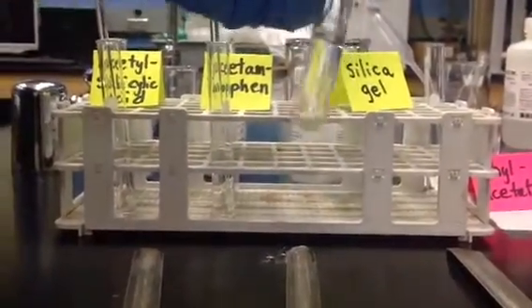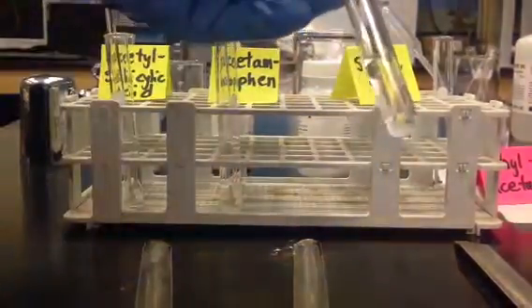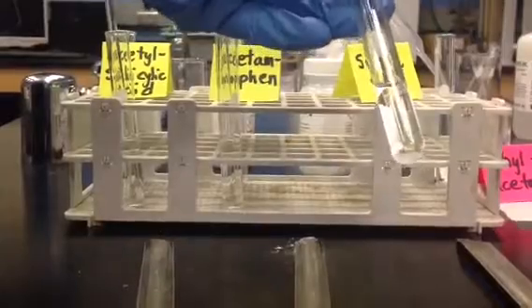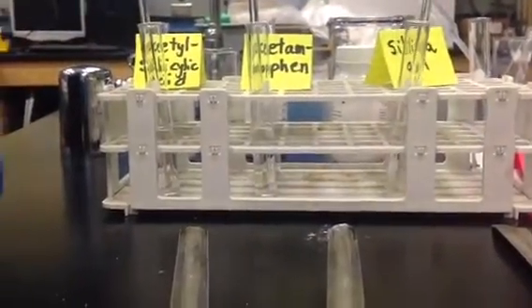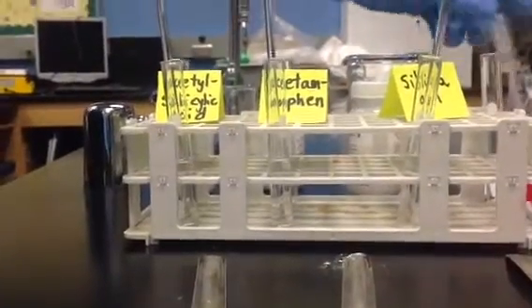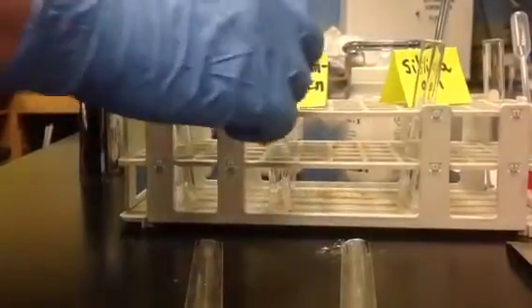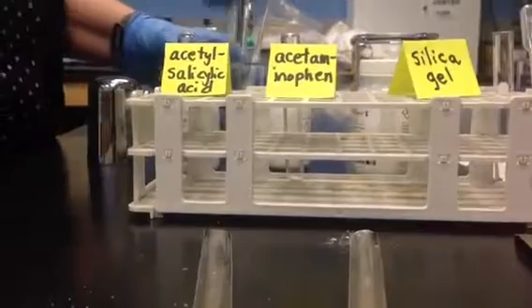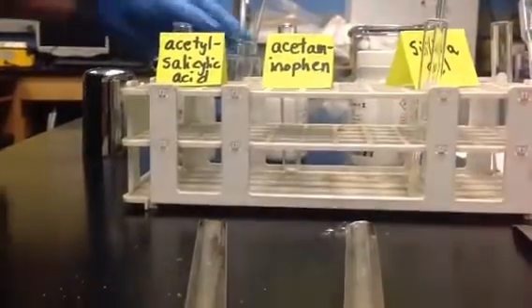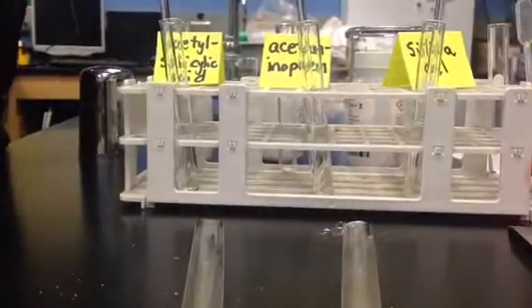At this point, the other two were dissolved, and this is definitely not. You can see the kind of cloudy appearance at the bottom of the test tube. That's where the silica gel is, and it is not dissolved. So the binding agent, the silica gel, is not soluble in the ethyl acetate. The other two are. Okay, that's one important thing we need to know. Oh, we do need to do the water. So now we're going to add water. My test tubes may be a little small.